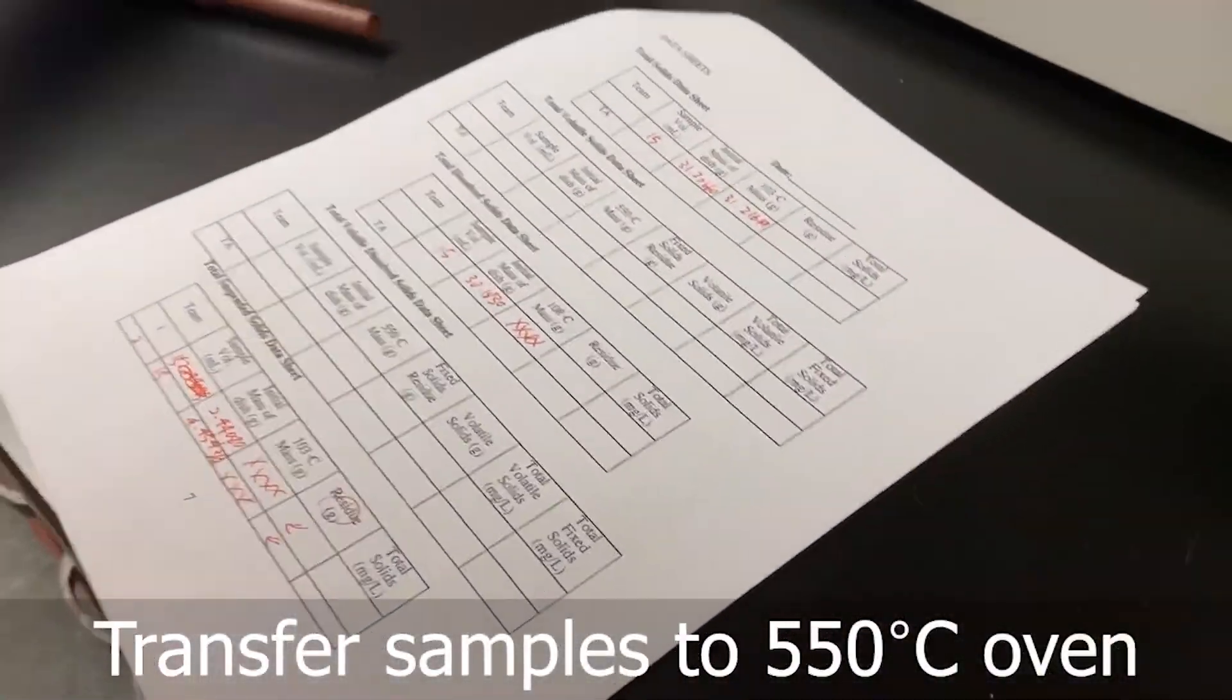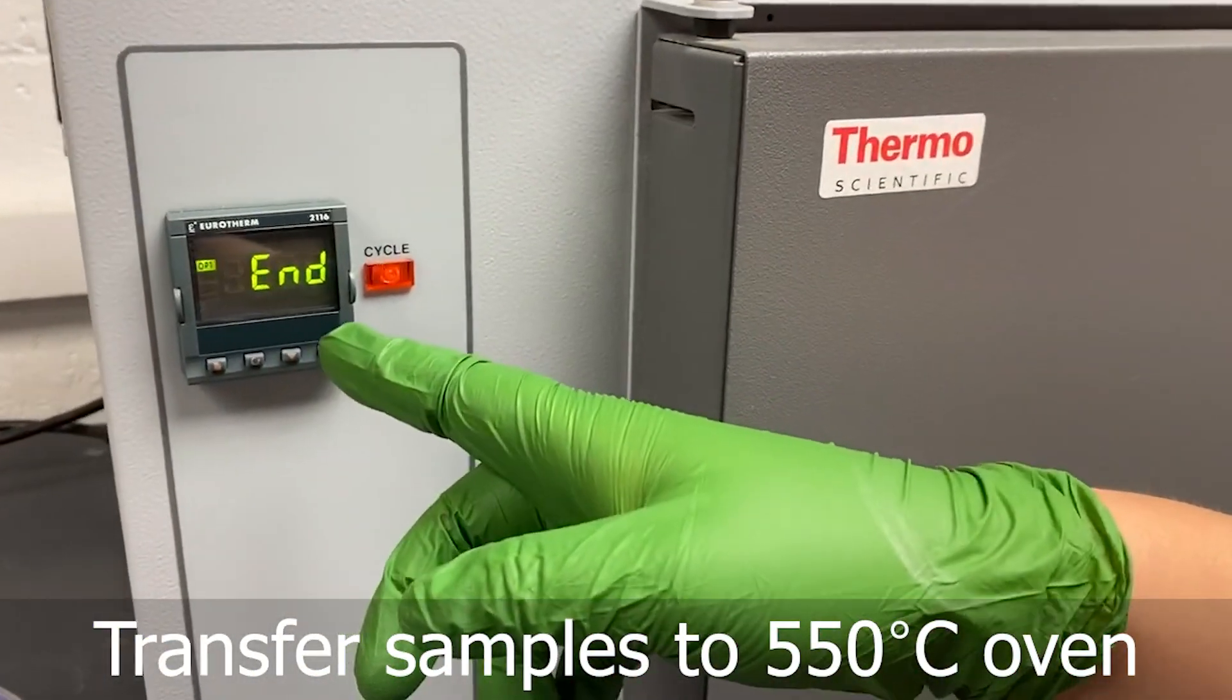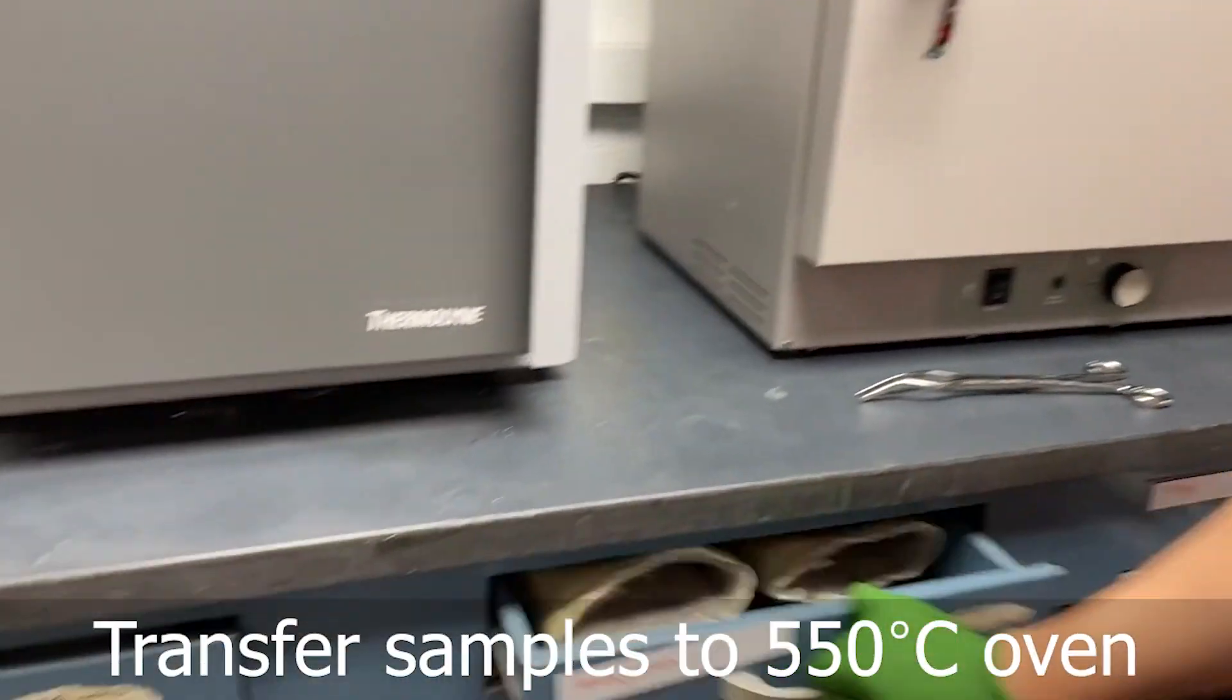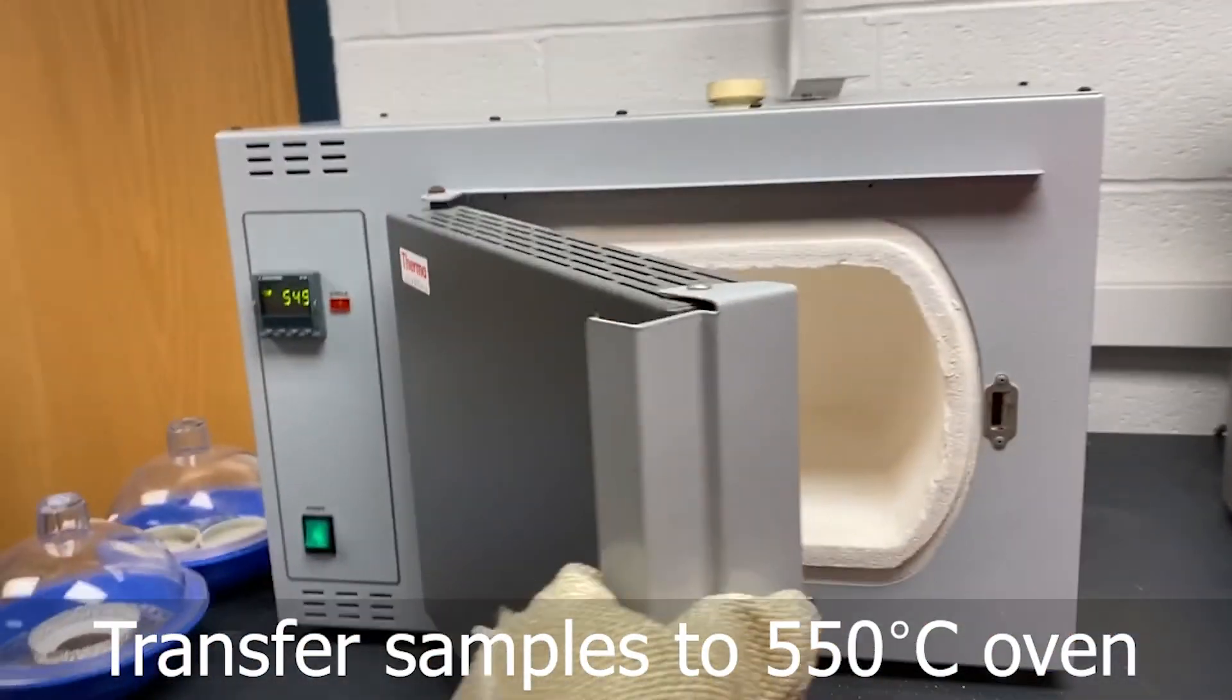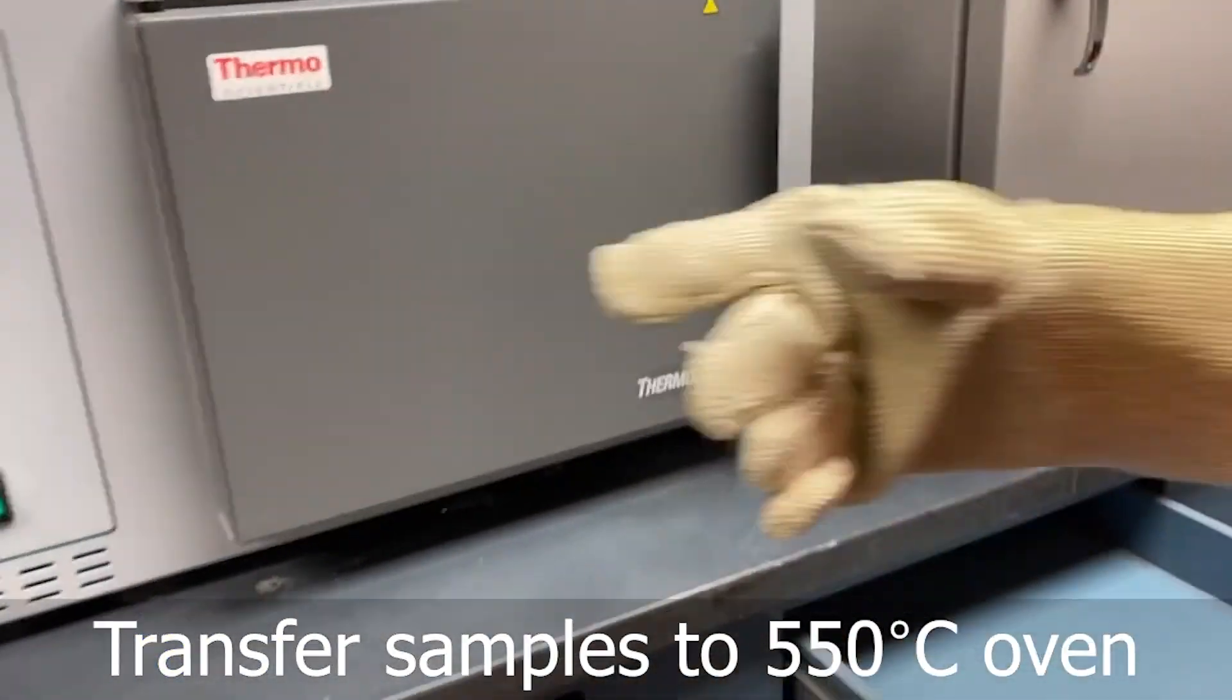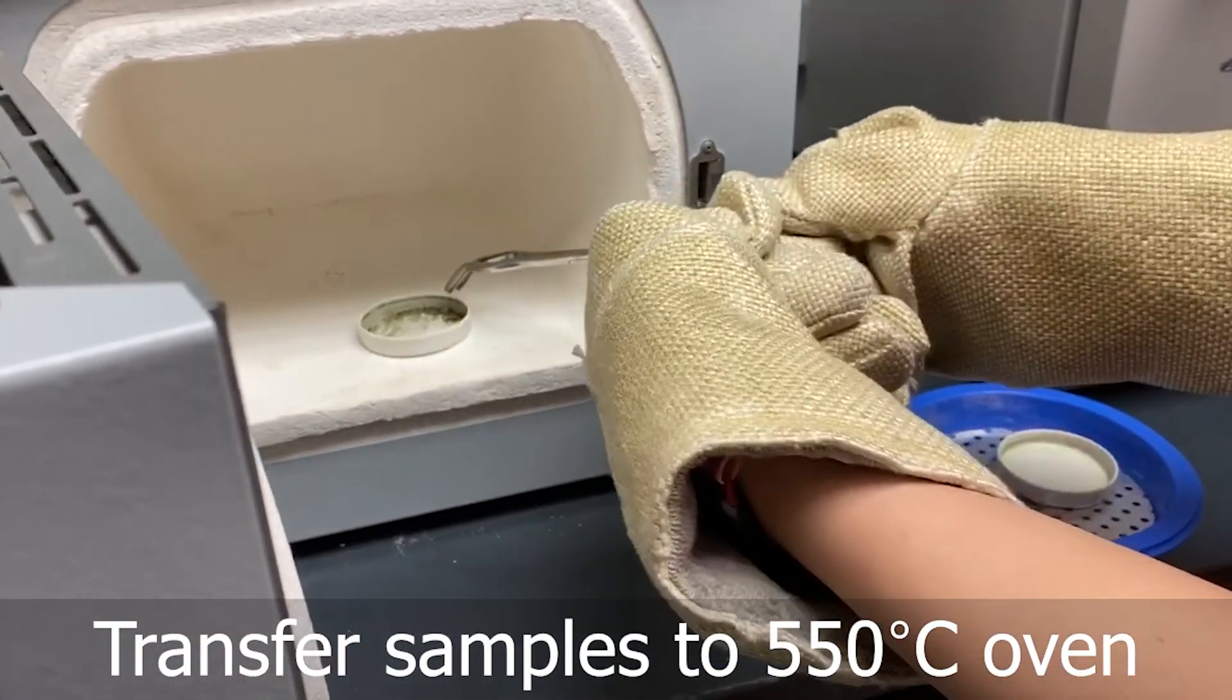After measuring the mass, we are going to put them into 550 degree oven. So this is 550 degrees oven and it is very hot inside. When we are using this, we need to wear this glove. So we are going to put all of these samples into the oven.